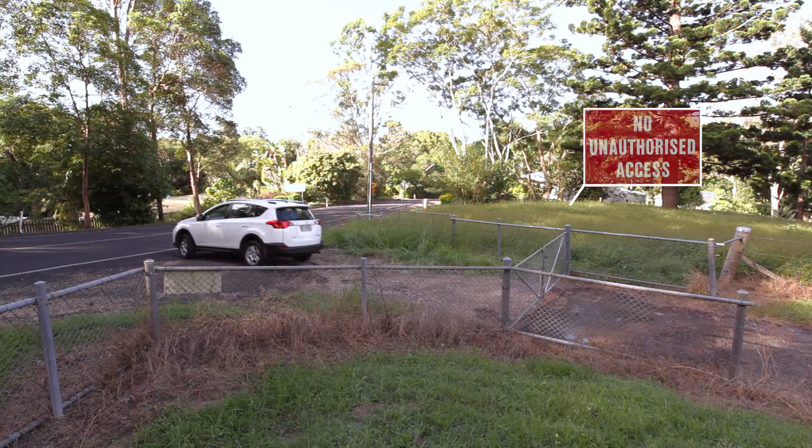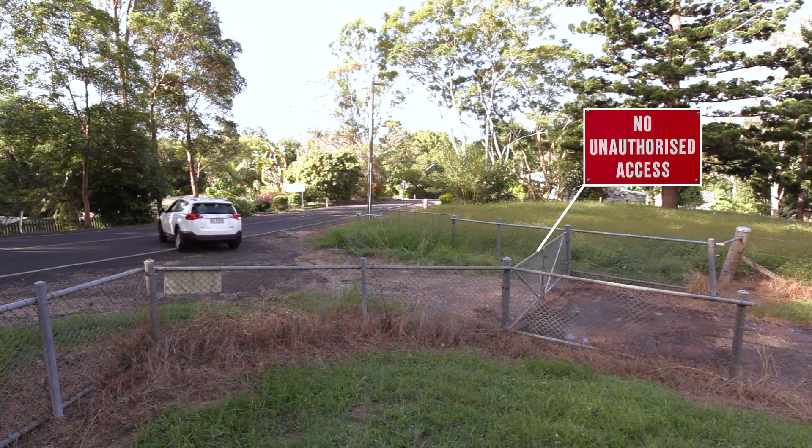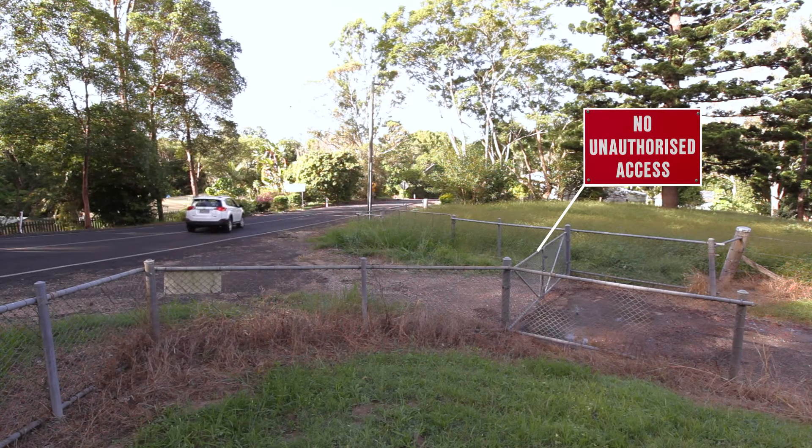Finally, remember to place a no entry sign and to secure the premises entrance upon your departure.